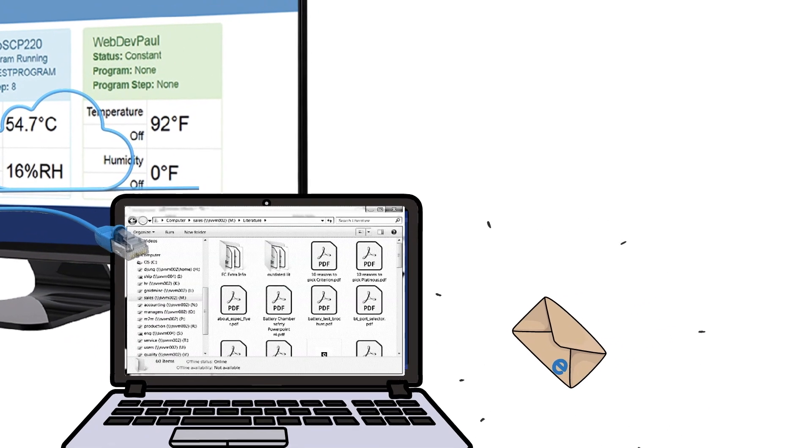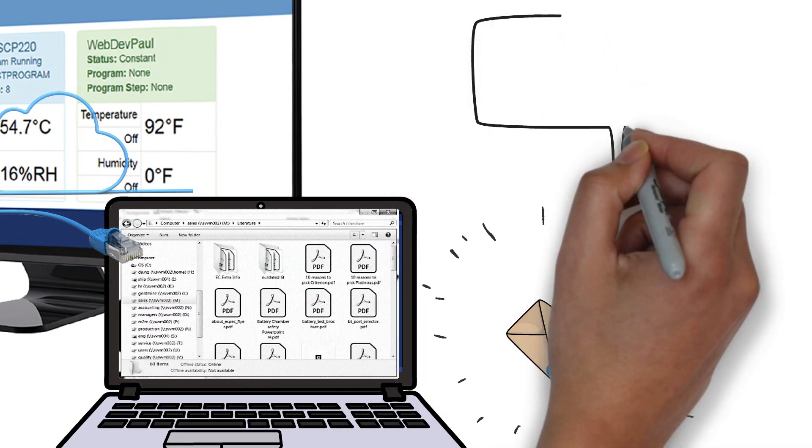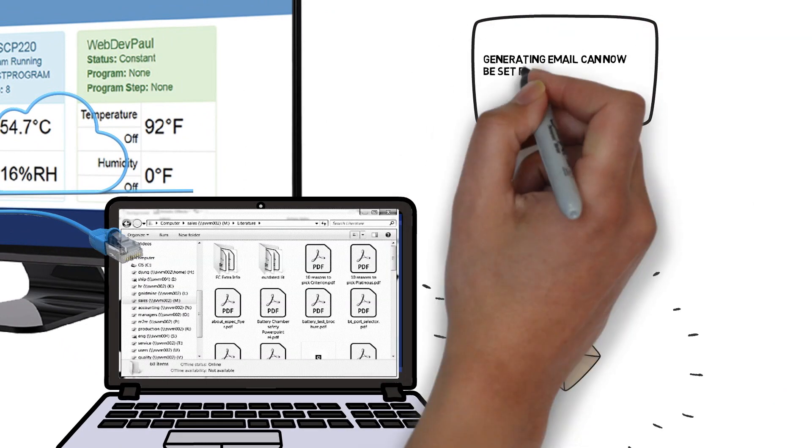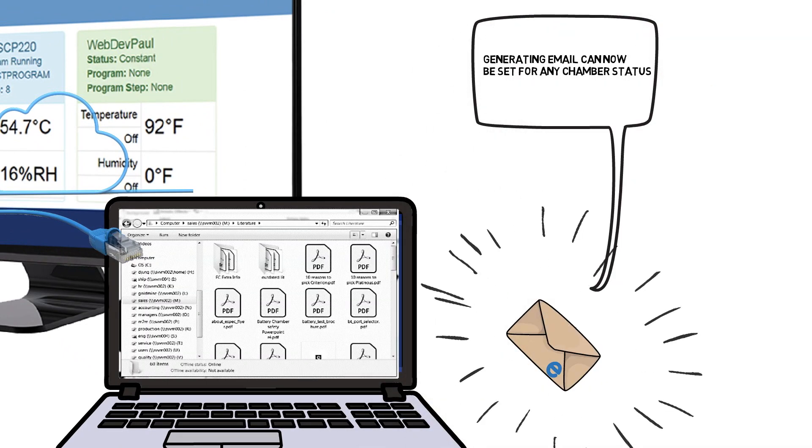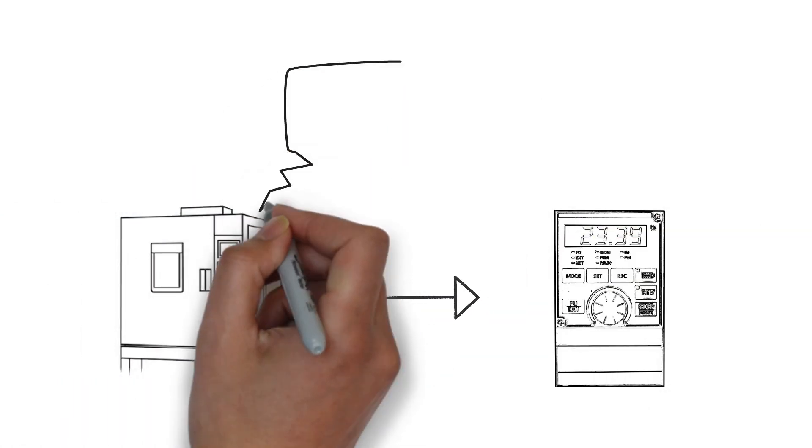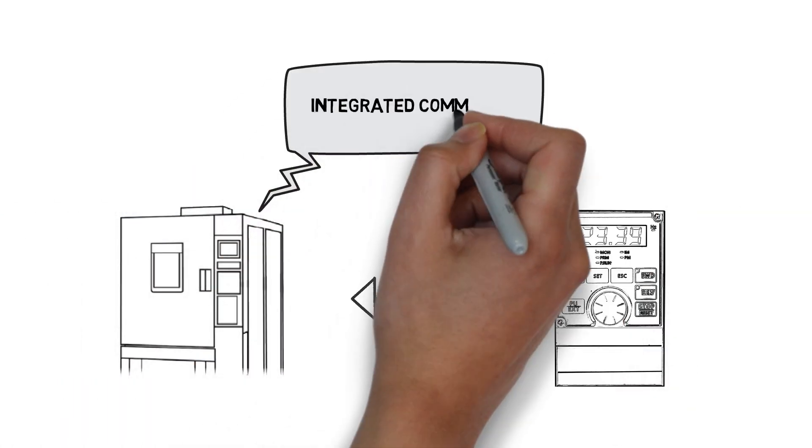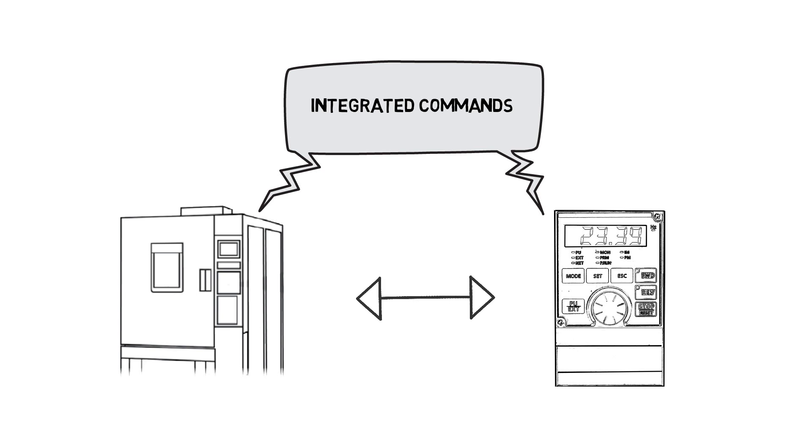But that's just the beginning. Actions like generating email can now be set for any chamber status. Other test applications and equipment can be integrated with chamber operation, enabling them to talk to one another.